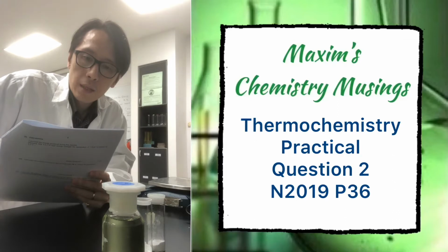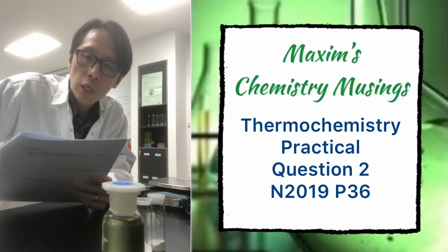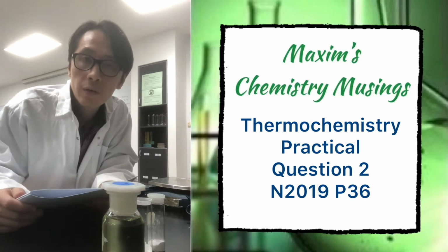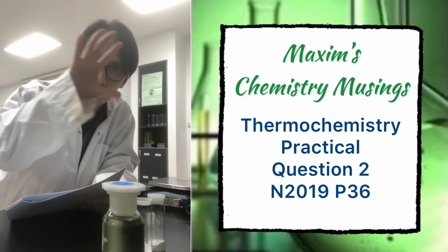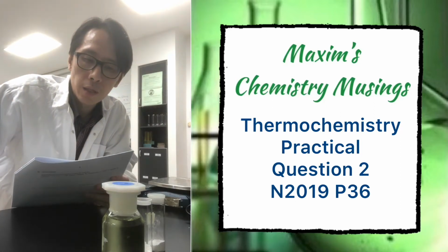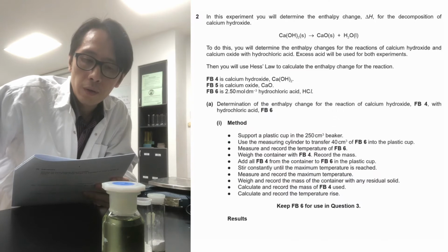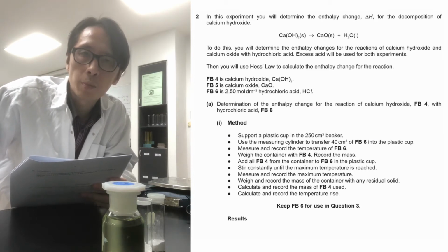Good day, class. Today we're going to attempt a practical regarding enthalpy change for the decomposition of calcium hydroxide. I will briefly show a picture right here, so you can see the reaction itself. It's the thermal decomposition of calcium hydroxide becoming calcium oxide and water. Unfortunately, to do the actual enthalpy change measurement, it will be pretty difficult.